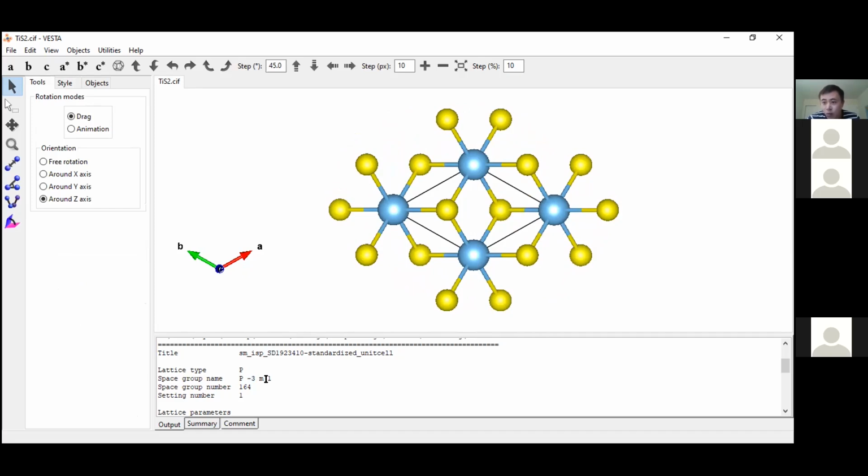And the third one is 1. That basically indicates there's no specific symmetry, just the identity. For the trigonal system this is like the 210 direction. For example, if you had symmetry around this direction, then you would probably have some additional symbols here, but there's no symmetry in those directions. So there's only 1. That explains the notation of this space group, which is quite informative.